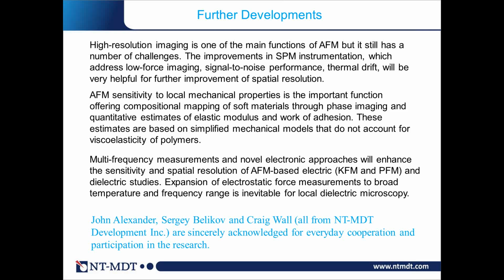When you do this basic work for any mode, including PeakForce, it will give you reliable data. But so far, I haven't seen a strict work showing that this can be done. In principle, it can be done. Therefore, I will be happy to learn and to find out what is the best method to do that.